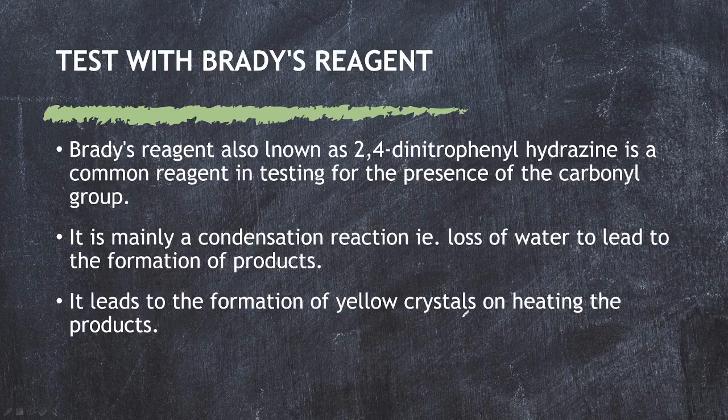Test with Brady's reagent. Brady's reagent, also known as 2,4-dinitrophenylhydrazine, is a common reagent used in testing for the presence of carbonyl groups.